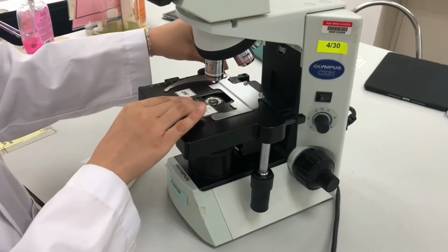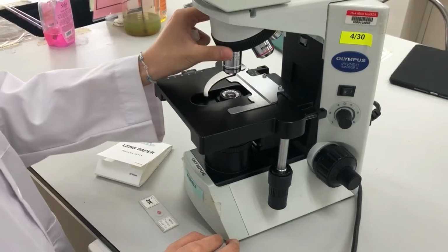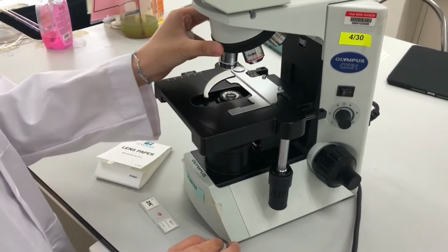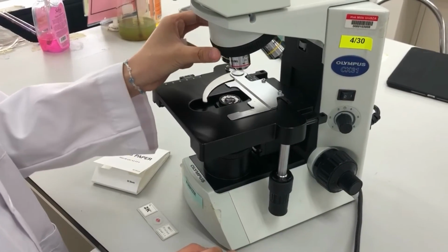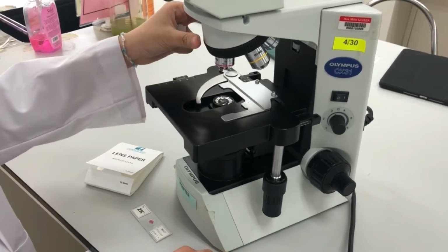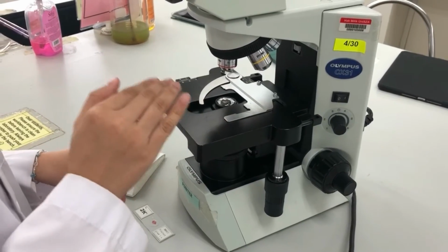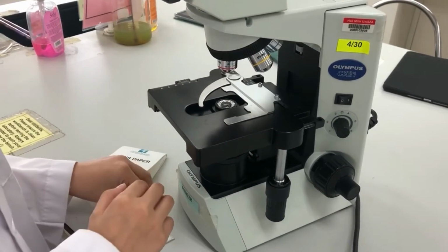Next, remove the slide off the stage. Gently rotate the nosepiece again. Place the scanning objective lens back in position over the center of the stage. If oil is found on the stage, clean the stage by using lens tissue.